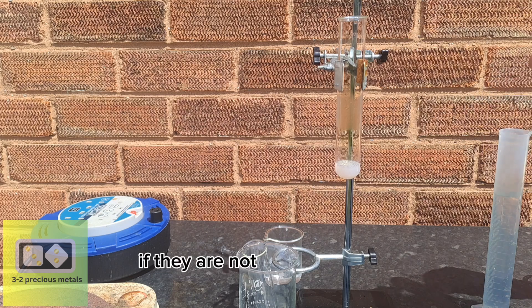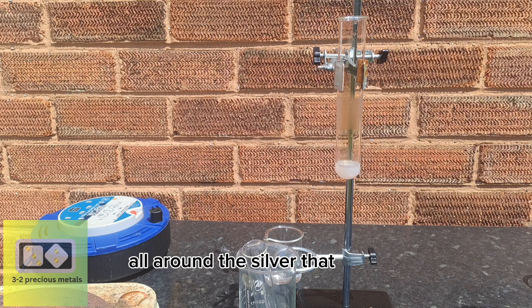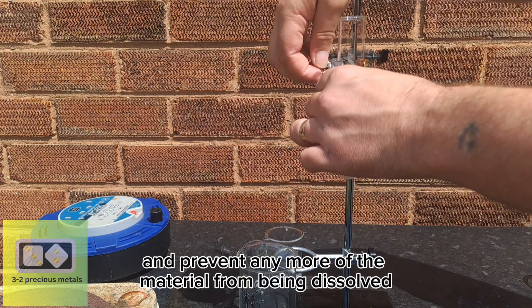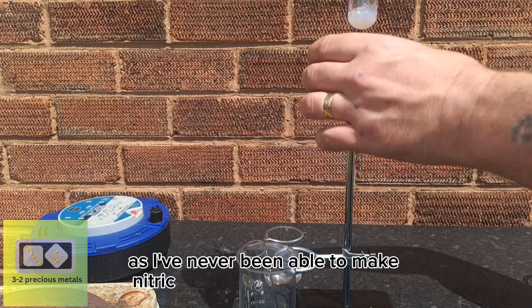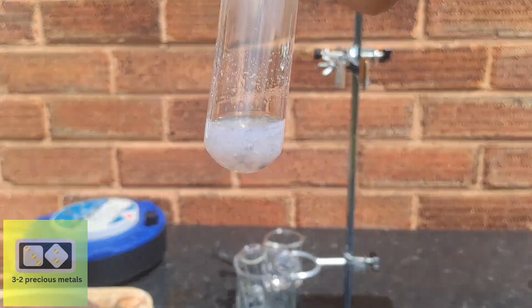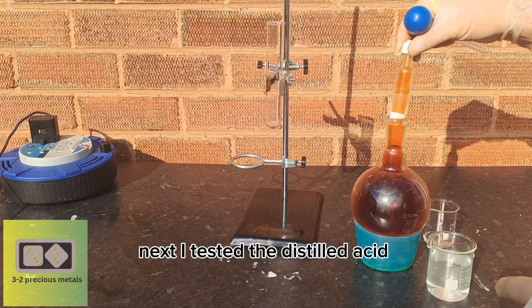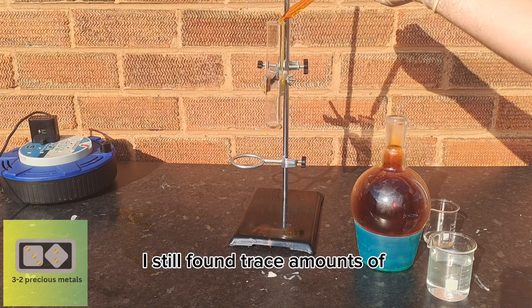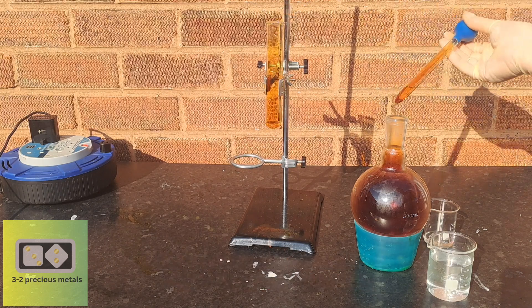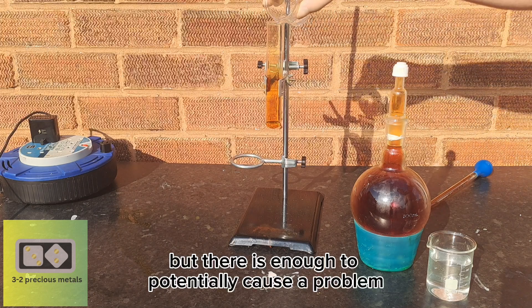These chlorides need to be removed from the acid before attempting to dissolve silver. If they are not removed, when the silver dissolves, silver chloride will form all around the silver and prevent any more material from being dissolved. I did expect some chlorides as I've never been able to make nitric acid without finding some. I also tested the distilled acid and, although it has been distilled, I still found trace amounts of chlorides — not as much as in the dilute acid, but enough to potentially cause a problem.